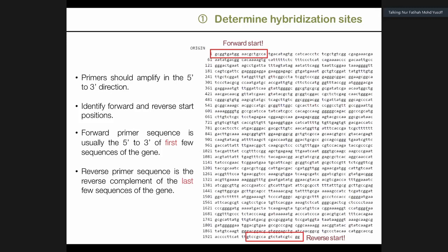You have learned this in previous practicals, right? So you get the forward sequence and then the reverse primer sequencing result. Now you can do the alignment to see the full length. Originally, in sequencing analysis, that's what they do. They do the PCR sequencing using the forward primer and another one using the reverse primer, so separately.